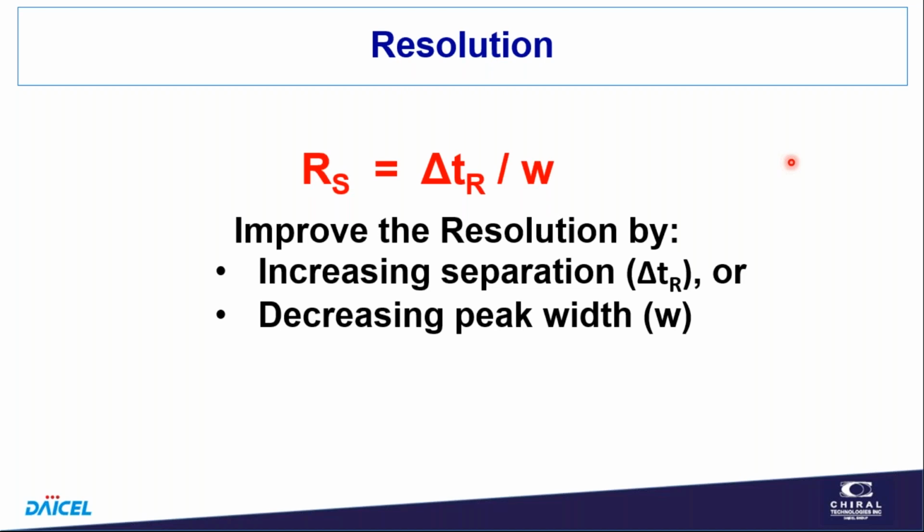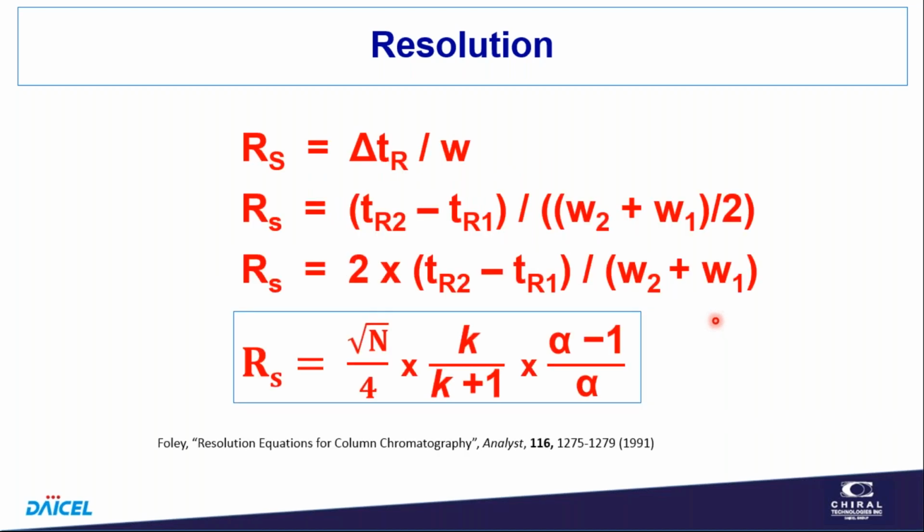Chromatography is a separation technique, so probably our fundamental equation is the resolution equation, just a measure of how good the separation is. So we can improve resolution by increasing the difference in retention time between the analytes or decreasing the peak width. We can expand this equation.